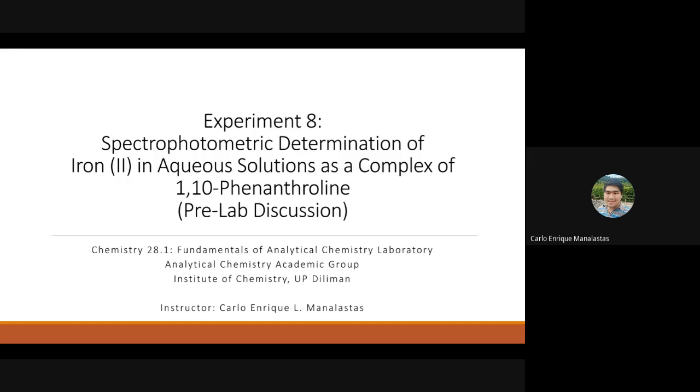Hi, for this recorded video, we will be discussing the pre-lab for Experiment 8 titled Spectrophotometric Determination of Iron(II) in aqueous solutions as a complex of 1,10-phenanthroline.